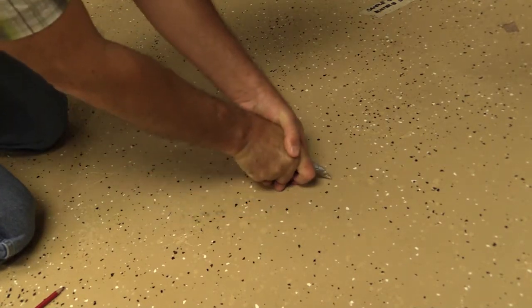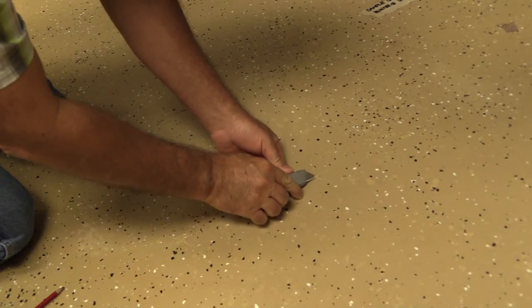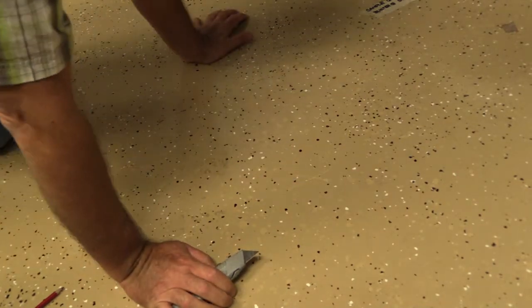ASTM D6677 involves cutting an X through the coating and probing at the cross-section. The ease of removal of the coating is rated subjectively on a 0 to 10 scale, with 10 being no removal.